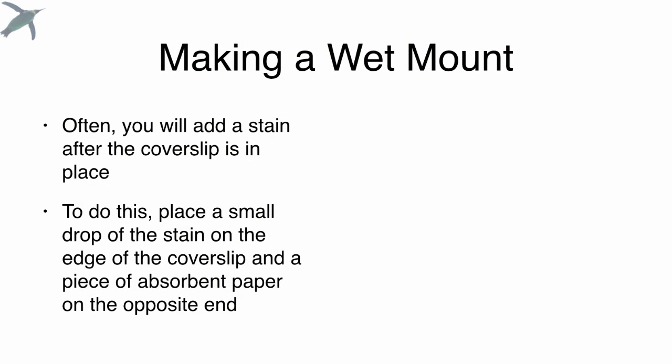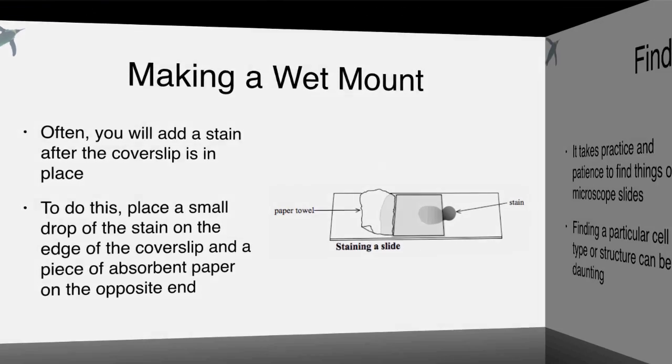Often you add the stain after the cover slip is in place. To do that, you just add a drop of the stain at the edge where the cover slip and the slide meet. Then you place an absorbent material, you can use a paper towel or a Kimwipe at the opposite end, and it will wick the fluid and draw the stain across the specimen. It's a really nice way of evenly distributing the stain across the slide.